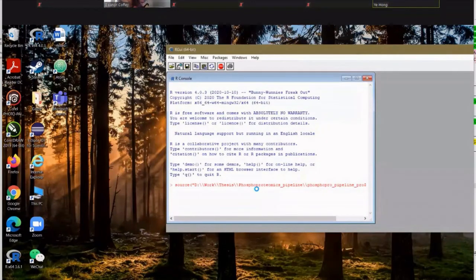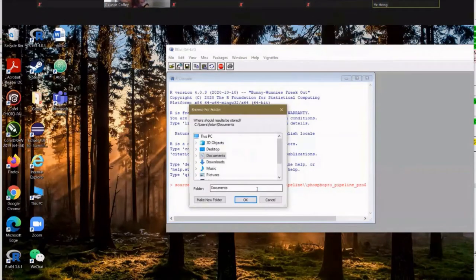So at the first time when you run it, it's going to download a lot of libraries, because this isn't my first time running it, so it's not really downloading anything. It's just going through the list of code I have. But then when it starts to install things the first time, don't worry, that is normal.